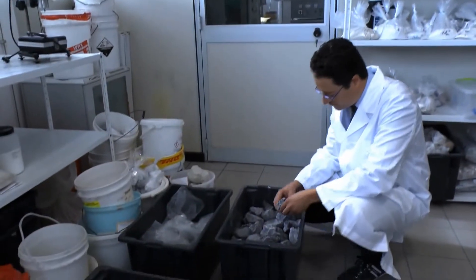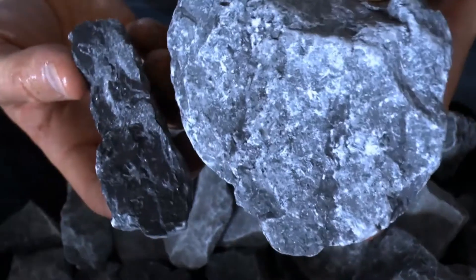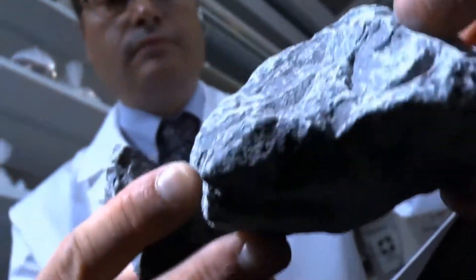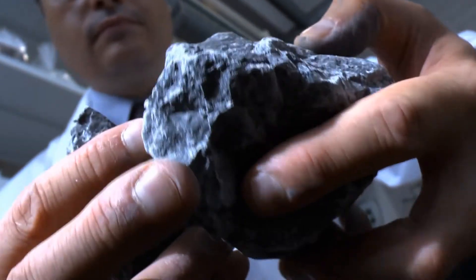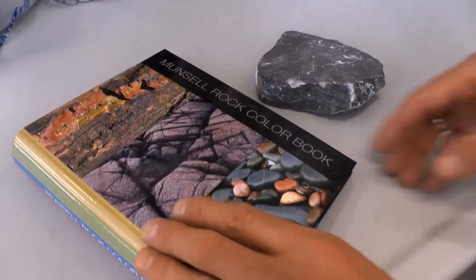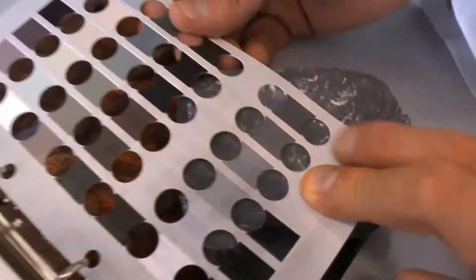Preliminary lithological analysis is performed on the rock sample as received to evaluate general but important parameters such as color, apparent density, porosity, and occasional superficial dust.